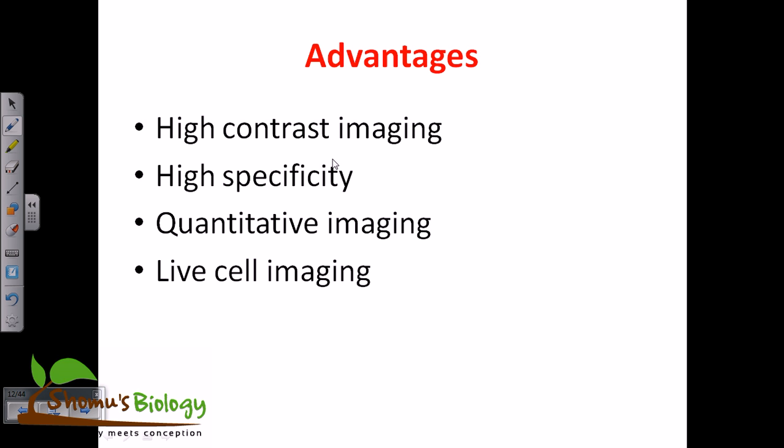And the most important thing is we can actually image a live cell or the living cell. That's very important, because we can tag those fluorescent dyes with the living cell which is growing, which is dividing, and we can take various snapshots in various formations using different types of dye at different times. Then we can superimpose them together using a monitor and CPU, and finally we can get the idea of what is going on in an animated form actually.